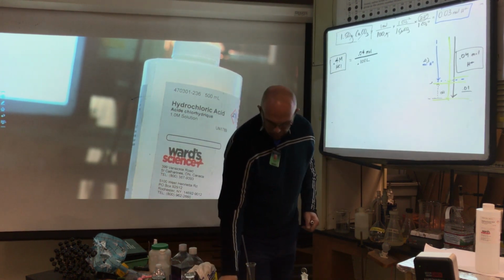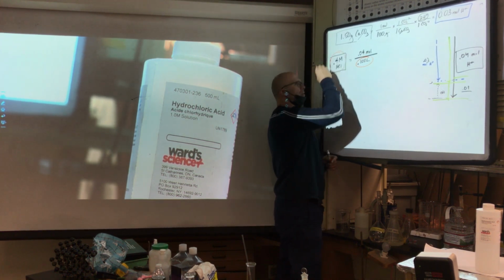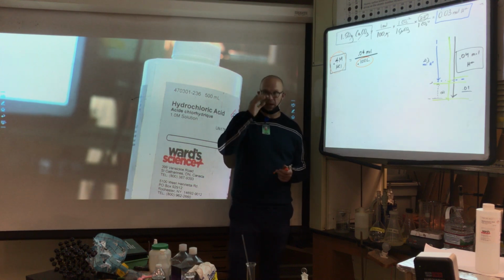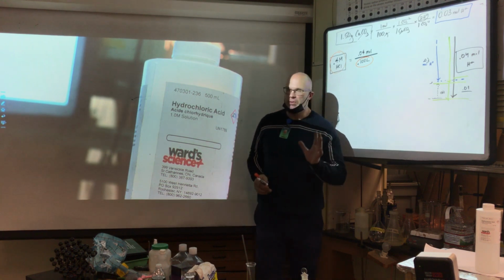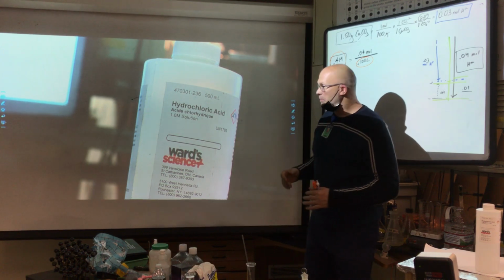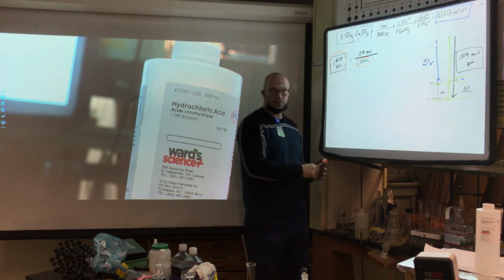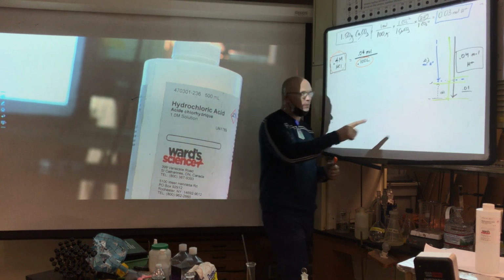I need 100 milliliters of this concentration to deliver this amount of moles of H+ to the beaker of the crushed tabs. All right, how do I make that concentration? Well, as we talked about yesterday, this entire titration, called a back titration, is dependent upon knowing 2 concentrations. We have to know exactly how many moles of H+ I've added, and we decided 0.4 molar is the concentration I need. And we have to do what?